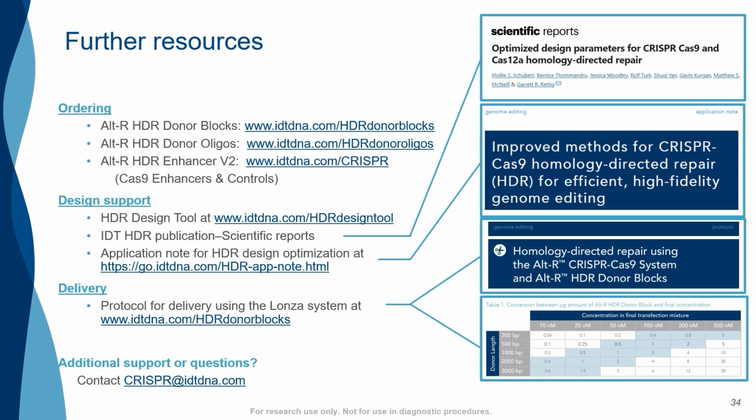Secondly, Cas9 requires the gRNAs at 100 nucleotides that consist of the crRNA and the tracrRNA, while Cas12a has a much shorter gRNAs at approximately 40 to 44 mers in total. At IDT, the gRNA of Cas12a consists of a spacer sequence at 21 to 24 mer together with the optimized conserved region. Additionally, the Cas12 system possesses the trans-DNA cleavage activity, resulting in a non-specific single-strand DNA cleavage.